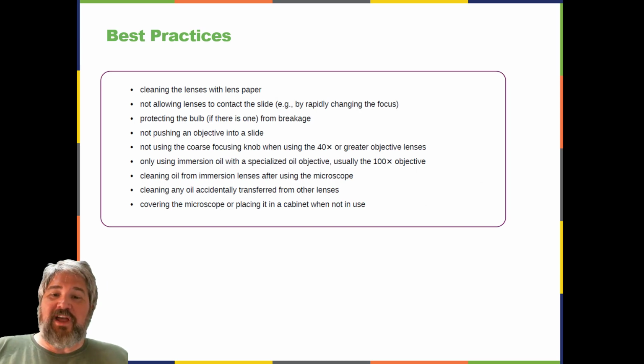Microconnections, microscopic maintenance best practices. Even a very powerful microscope cannot deliver high-resolution images if it is not properly cleaned and maintained. Since lenses are carefully designed and manufactured to refract light with a high degree of precision, even a slightly dirty or scratched lens will refract light in unintended ways, degrading the image of the specimen. In addition, microscopes are rather delicate instruments, and great care must be taken to avoid damaging parts and surfaces.